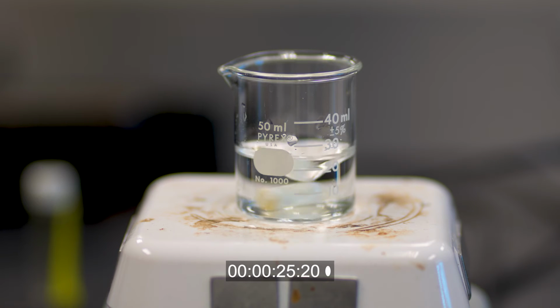It was suspected that there was not enough starch to form the classic, really dark bluish black iodine reaction color, so we added a bit more starch at the very end to create the desired color.